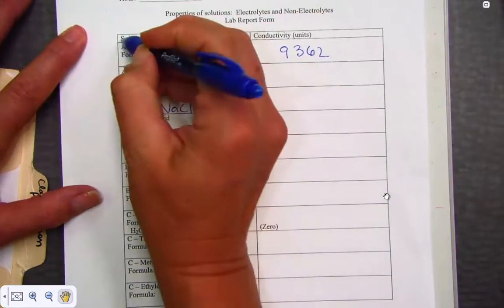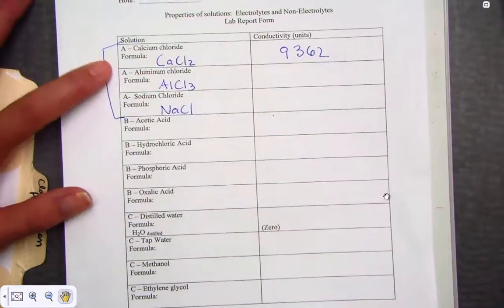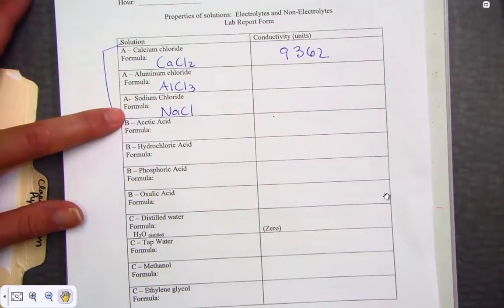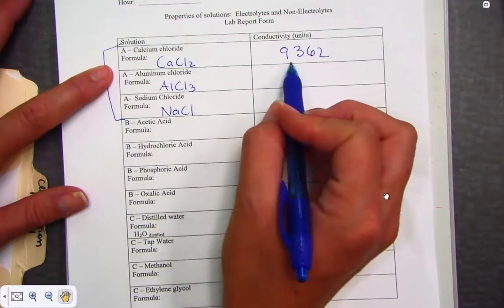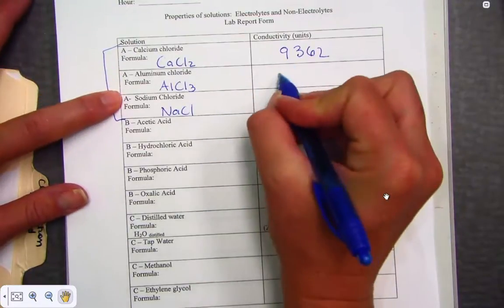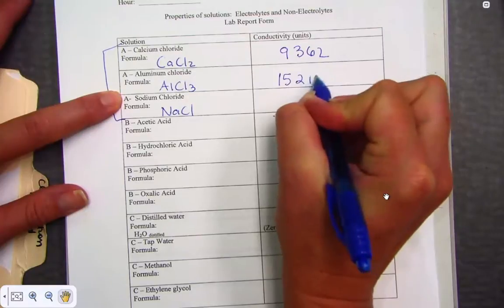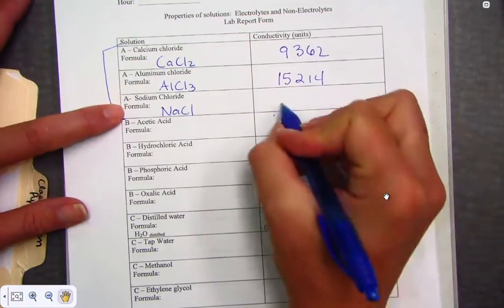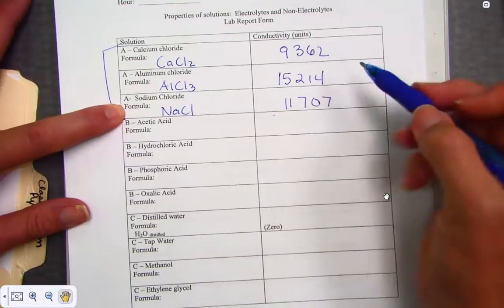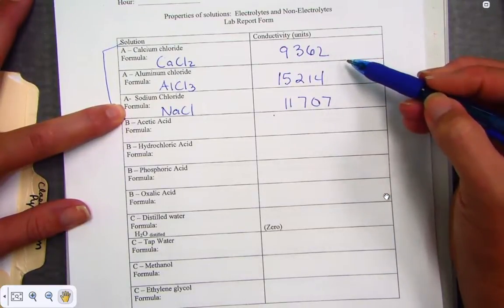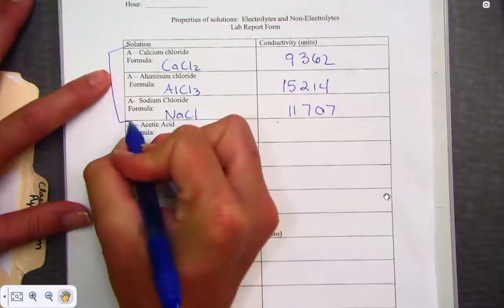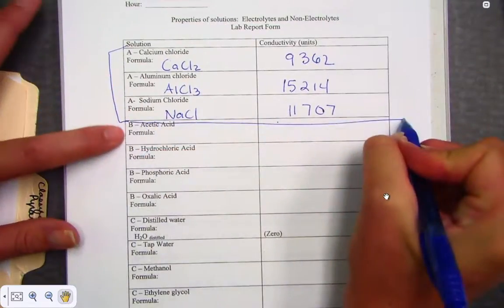So for category A, three different ionic compounds. Calcium chloride, about 9,362. Aluminum chloride, 15,214. And sodium chloride, 11,707. To repeat, these numbers aren't important. It's the magnitude when we compare them that I find very important.